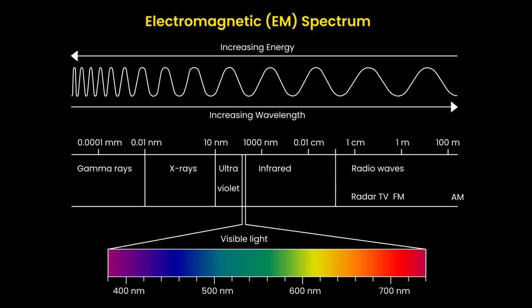If the photon emitted by the metal cation is one of the 7 colors in the visible region of the electromagnetic spectrum, you can see a color. This emission is specific to a metal cation. That is why you see the characteristic color in the flame. A flame test is the simplest way of identifying the presence of metal ions in the compound.